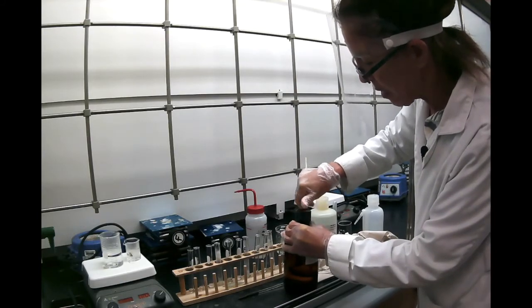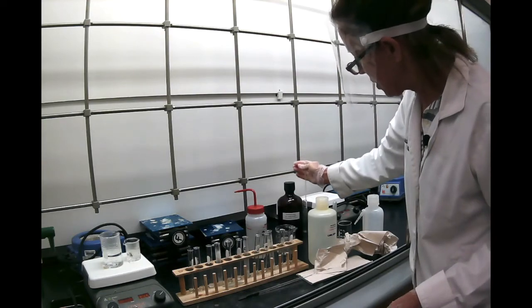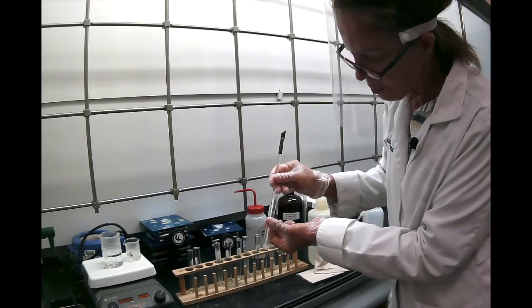Petroleum ether is a mixture of alkanes, which means that it is non-polar. So let's look at resorcinol in petroleum ether.